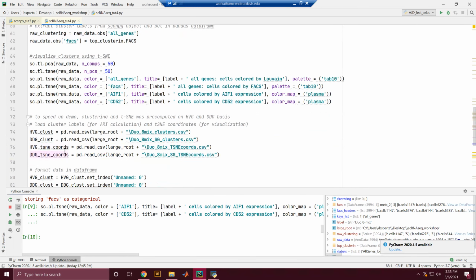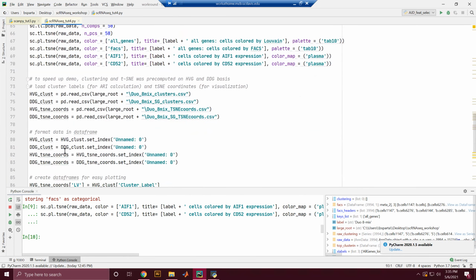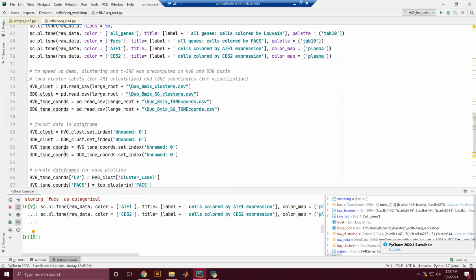And here we are just using the raw counts, so I didn't include any of the normalization when doing the clustering. However, normalization was used to select the highly variable genes, but it's not used for identifying these differentially distributed genes.